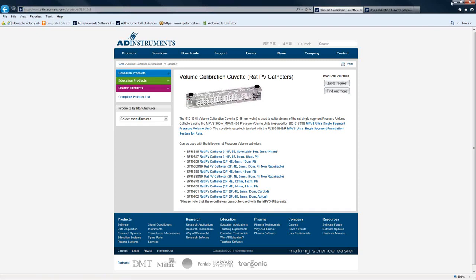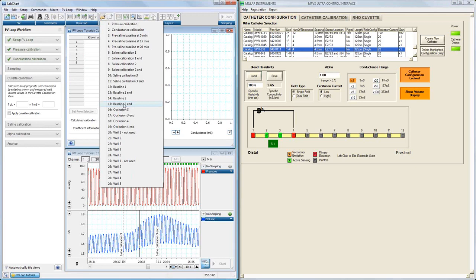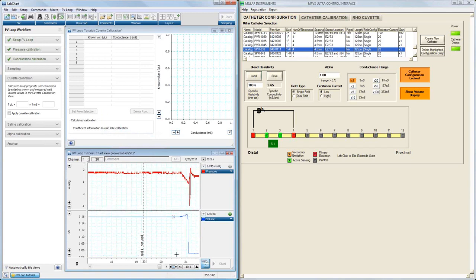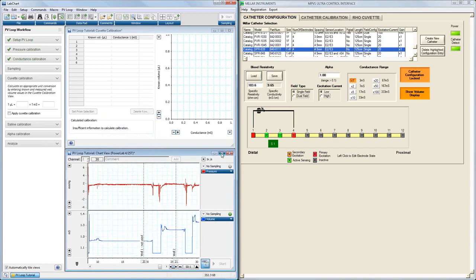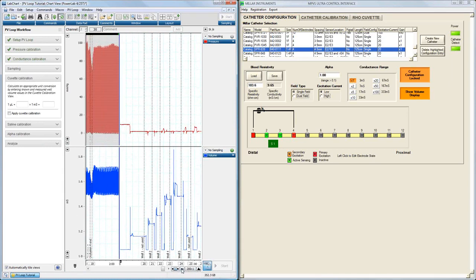So once we go through here and dip our catheter through, what is that going to look like? So let me go out to our region where we did that. And you can see here, we've actually marked it with comments. Well 1, well 2, well 3, well 4, well 5. We want to use about that amount of wells. We don't want to just do 2 wells and then just apply that.